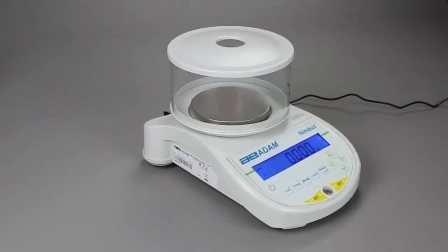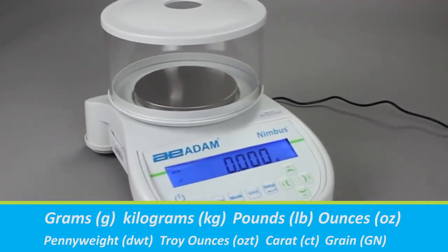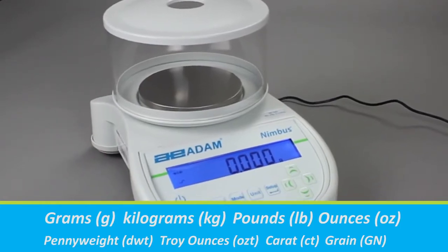Nimbus balances can display results in several different weighing units depending on your needs. You can disable unwanted weighing units to avoid weight reading errors.